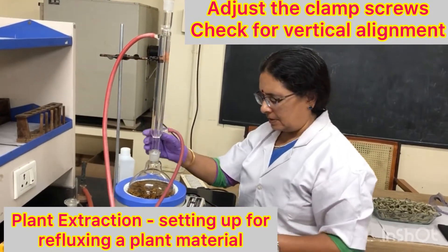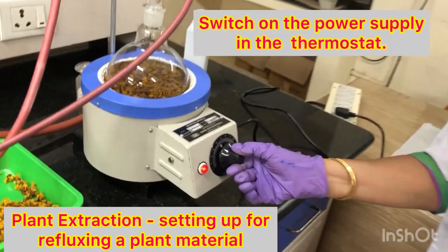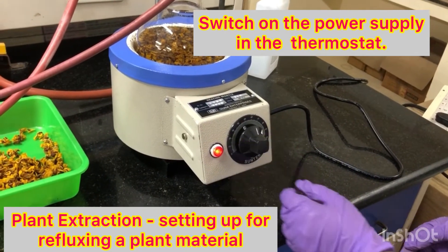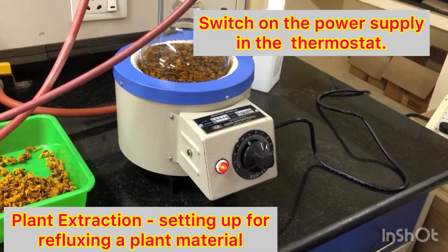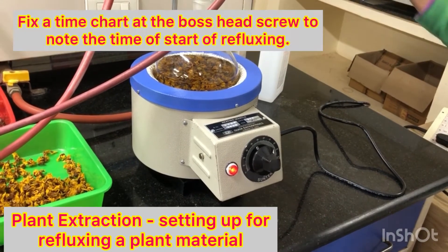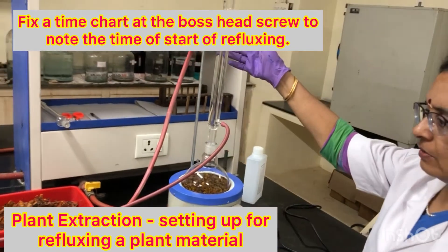I am fixing the condenser — check if the clamp is straight. We have fixed the condenser now. I am switching on and will keep the thermostat temperature indicator at 80. Once it starts boiling, I will reduce to 60 for uniform boiling. Note the time.